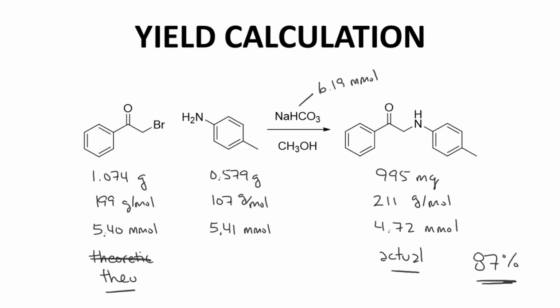Once you get down to about 95% purity, they typically call that a technical grade. It's not considered an analytically pure reagent. So we're well below 95%, sort of below a technical grade. So this is not a real high purity, but at least we got a lot of it. Anyway, it's a little bittersweet at the end, but that's our yield calculation for this experiment.